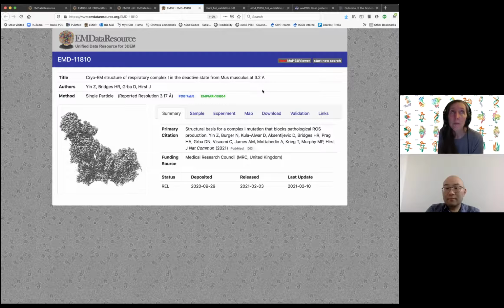Your deposition will be handled by the regional group that handles depositions from your country. So the US handles all of the Americas, North America and South America.